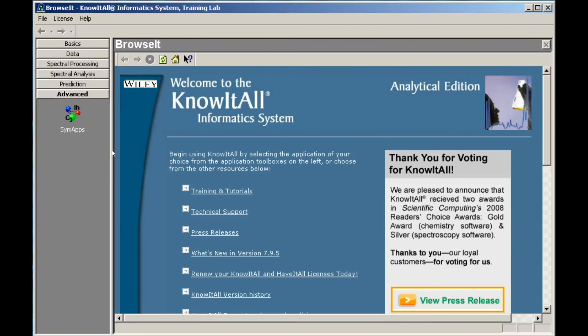The IUPAC toolbox has been removed. We can change the position of the new advanced toolbox by clicking and dragging its title bar.